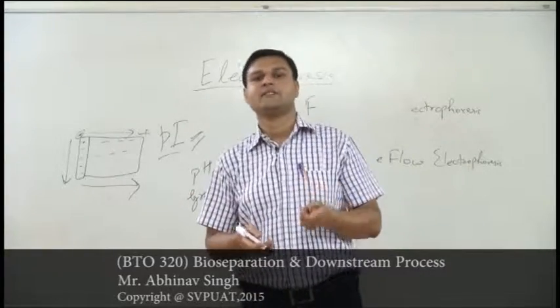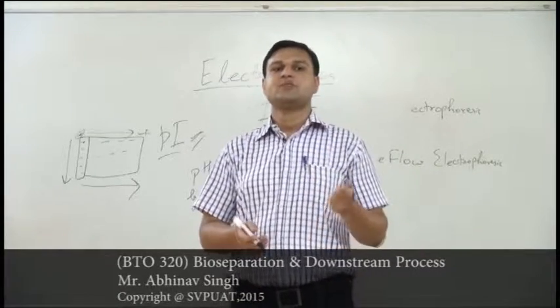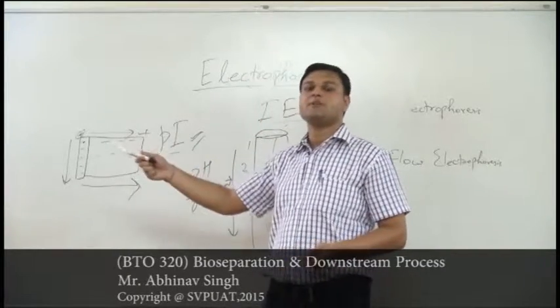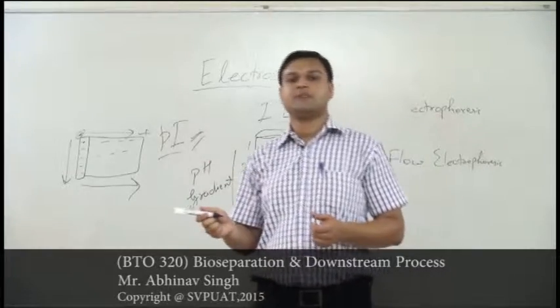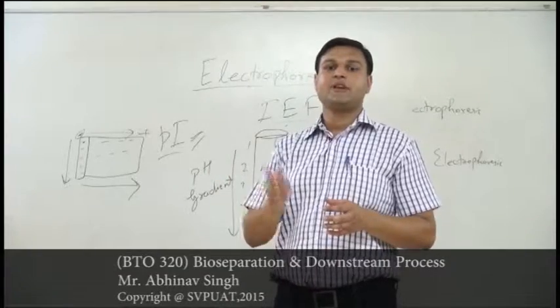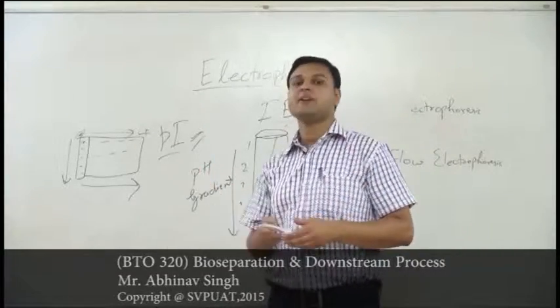As we know, nucleic acids, DNA and RNA, both carry negative charges, so they are loaded onto the negative terminal, and after the application of the power supply they move towards the positive terminus. Next, we have to add buffering agents containing electrolytes. Due to this, the molecules are separated according to their mobility.